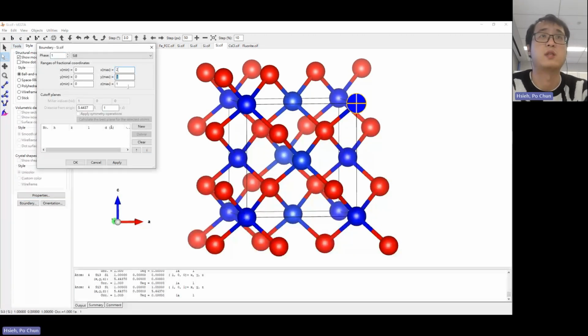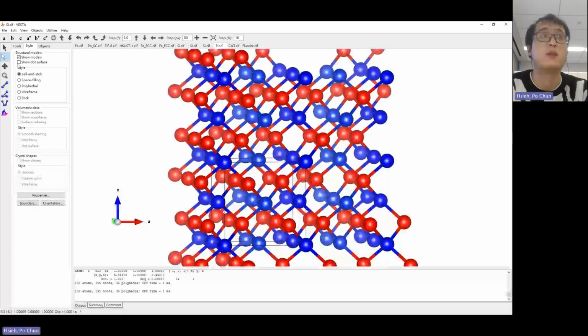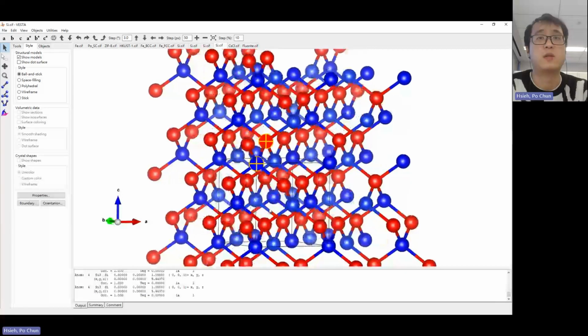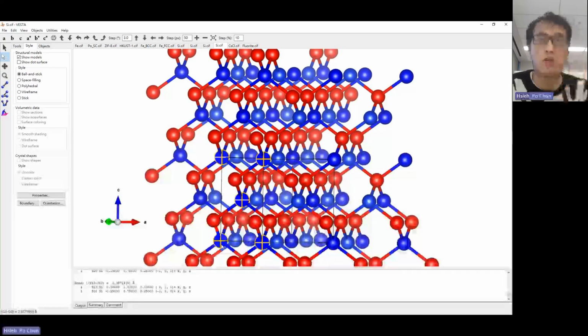Let's increase the scope. We are looking at this crystal, and we can see it here, right? And this one also. Even if we rotate a little bit to see the other end, you can see that these five silicon are also arranged in the same manner, right?